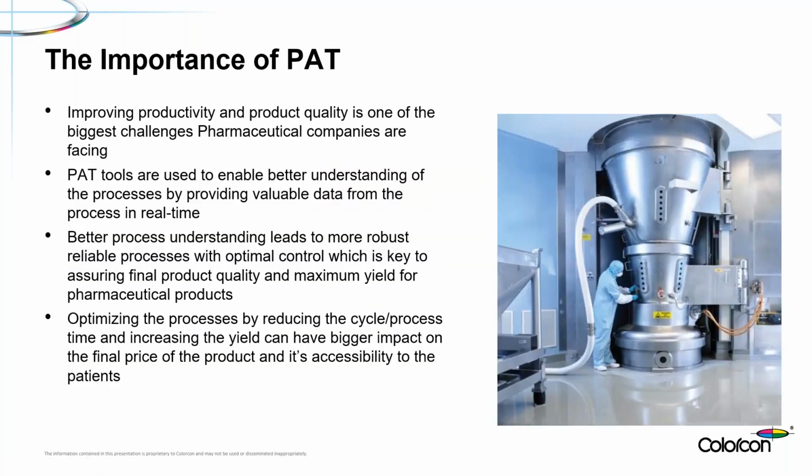On the importance of PAT, and Chuck set this up very nicely, talking about critical quality attributes of incoming raw materials. And the reason we focus so much on the critical quality attributes of incoming raw materials is they have the capacity to dramatically impact either how our process runs or the end result material we'll end up with.